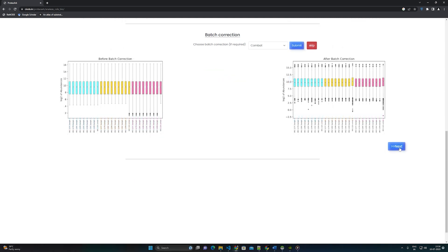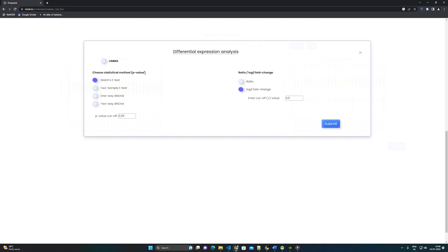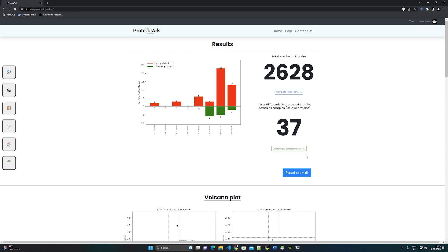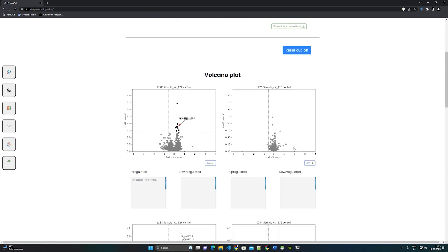Step 9: In Differential Expression Analysis, we provide options for p-value and fold change calculation. ProteoArc provides the LIMMA R package implemented by Docker for differential expression analysis. The significant cutoff value for fold change and p-value can be given by the user and is used to identify the differentially expressed proteins. The result page provides a bar chart to represent proteins that are upregulated and downregulated in every sample. Users can download the full result including normalization and differential expression calculation, and also a file containing only the differentially expressed proteins, separately in CSV format. A VolcanoPlot is provided for each sample-control comparison, using the significant cutoff value given by the user.